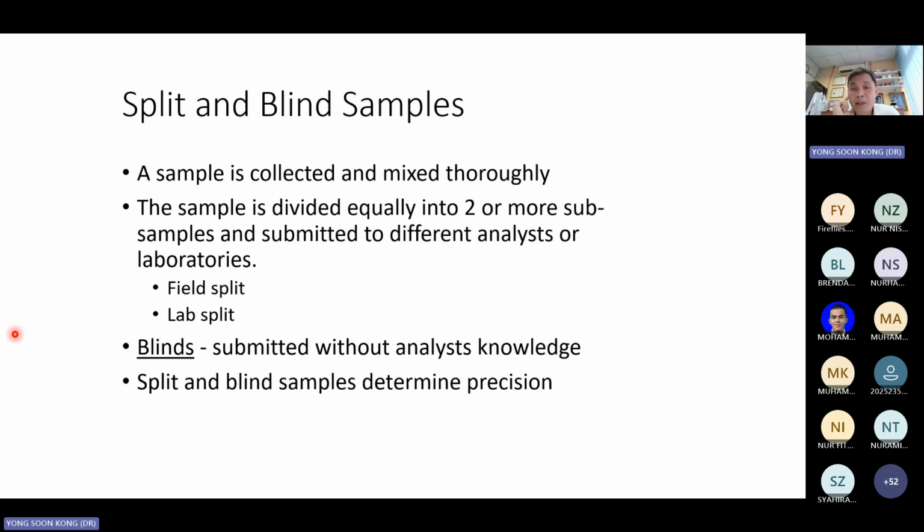Like for example, the spike, macam saya sebutkan, spike tu, bila kami nak letak spike, tujuan dia adalah untuk kita tahu sama ada teknik sampling maupun teknik analisis dan juga alat yang kami gunakan adalah tepat. So when we talk about spike, we're actually trying to measure accuracy.